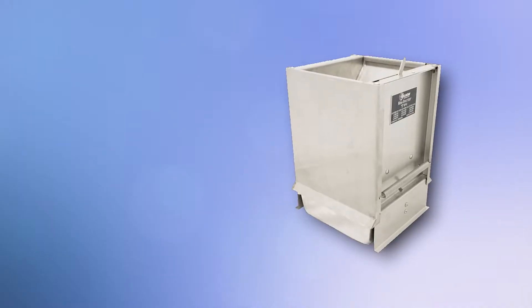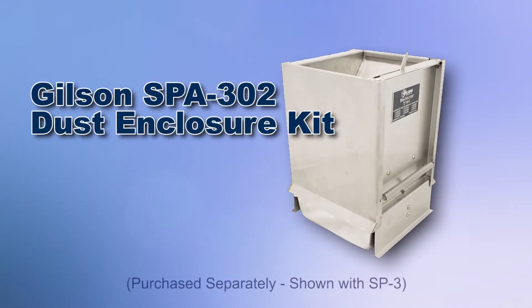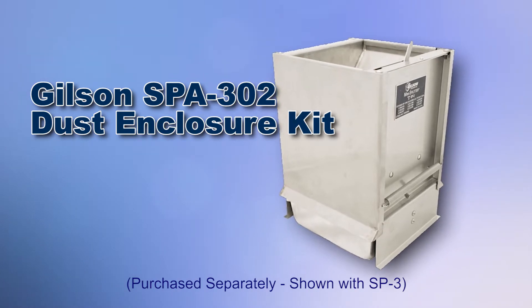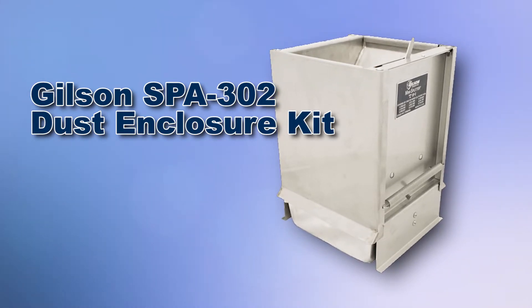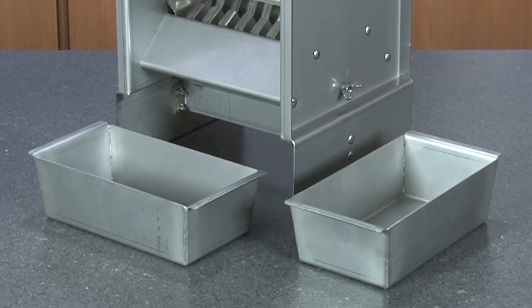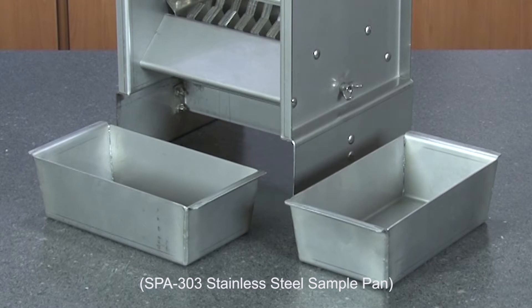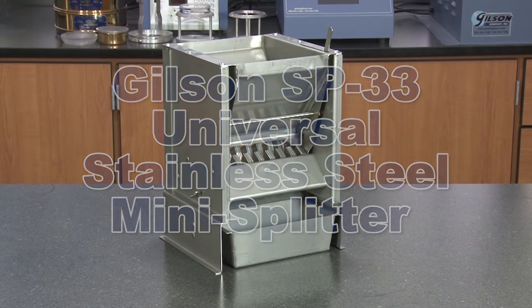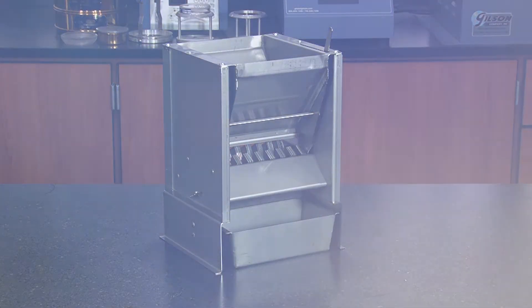The optional Gilson SPA 302 dust enclosure kit greatly reduces operational nuisance dust. The SB33 comes with two stainless steel sample pans, but additional pans are available for more efficient sample processing, making the Gilson SB33 Universal All Stainless Steel Mini Splitter the right choice for your materials testing lab.